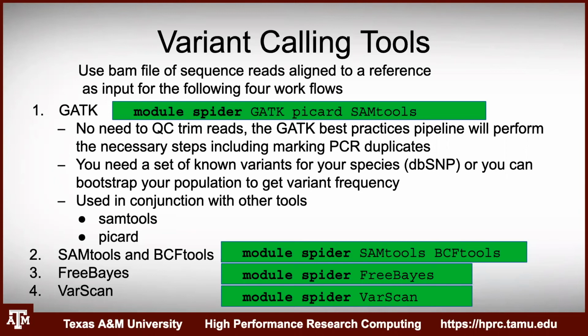GATK can do variant calling, as well as some other things. There's no need to QC trim reads. They've got a best practices pipeline that you can follow to ensure that you're following standard procedures that will be readily accepted by whatever journal you're trying to publish in.